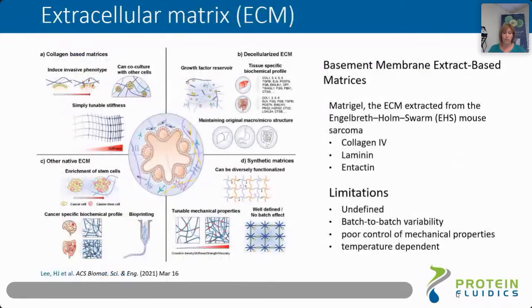So organoid culture typically requires growth factors and supportive matrices. The most used matrix for organoid culture is a basement membrane extract known as Matrigel. It is murine-derived extract containing collagen, laminin, and entactin. And although it is pretty widely used around the globe for the 3D culture, scientists do acknowledge its limitations, and efforts are being made to generate an alternative matrix that would be chemically well-defined, tunable, and reproducible.